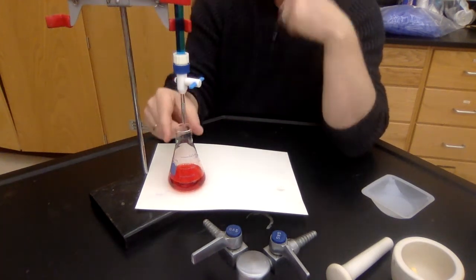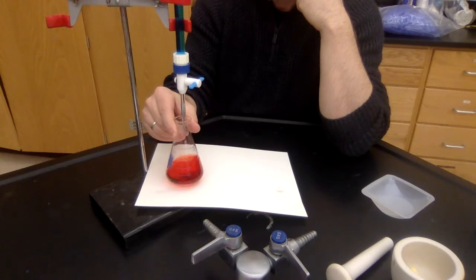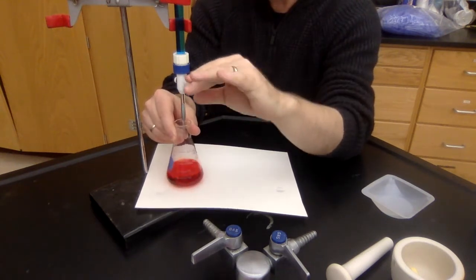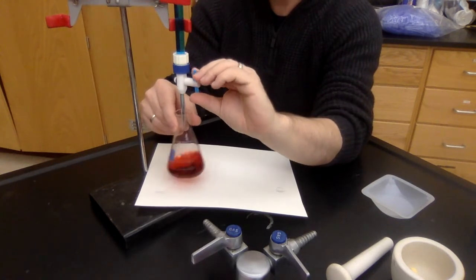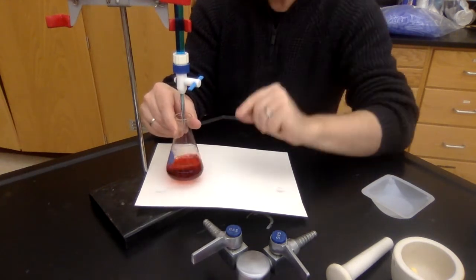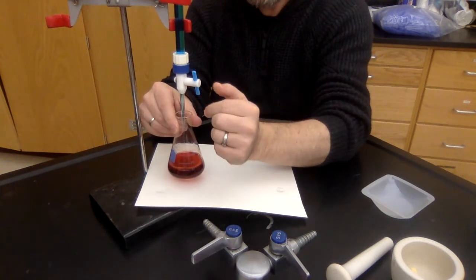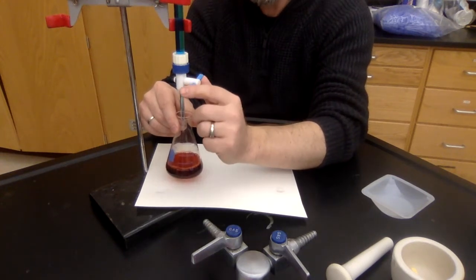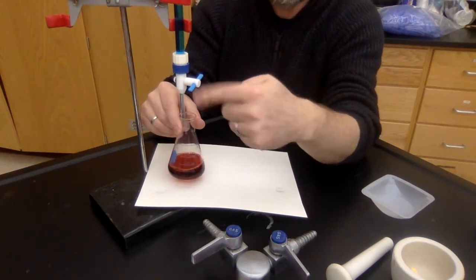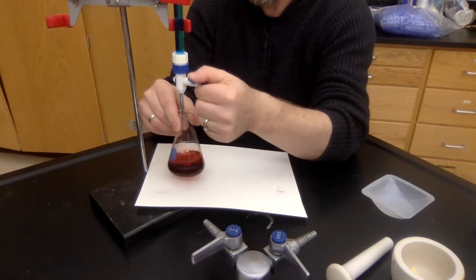I am right-handed, which means I'm going to hold this with my right hand and do a little stirring as I'm doing my titration. My non-dominant hand, my left hand, is going to be the one that turns this, okay? So I'm going, and then I don't know if you could see that very well, but what I did is I opened the valve, and then I'm always kind of turning the valve in one direction here. What am I doing? I'm doing clockwise. So you can open it up, turn it.